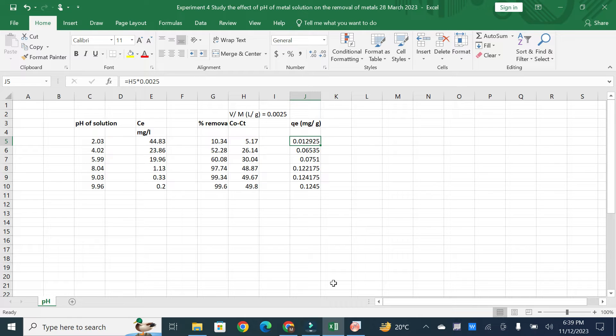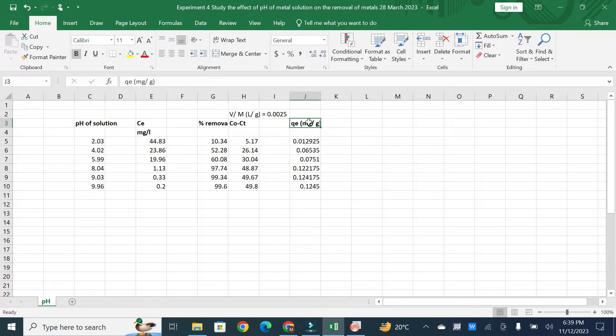Hello friends, in today's video we will discuss how to plot a two Y-axis graph in Origin Pro software. For example, if you have data with one X-axis and two Y-axis values — one is percentage removal and the second is QE — for instance if you are studying wastewater treatment and want to plot graphs regarding percentage removal and QE (maximum absorption capacity) with one variable parameter.